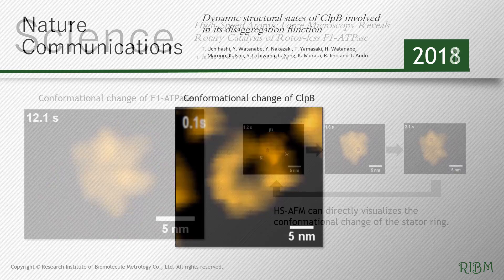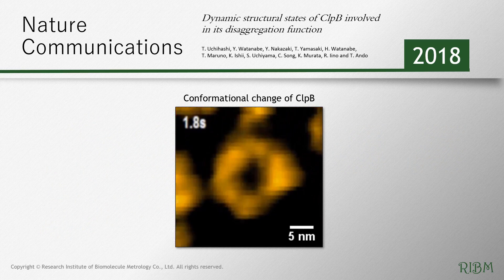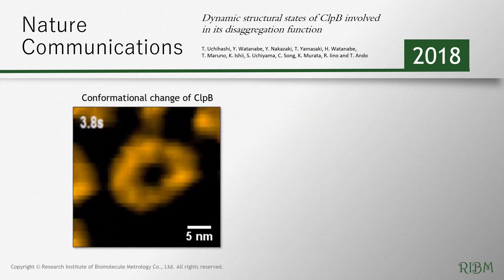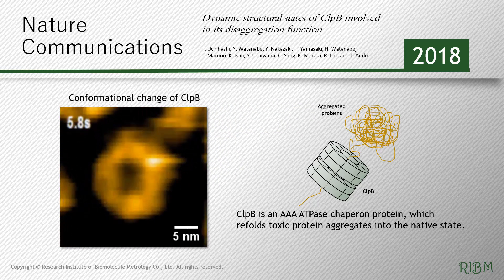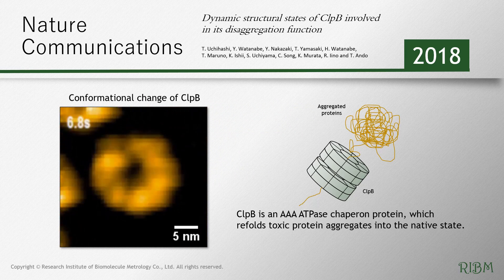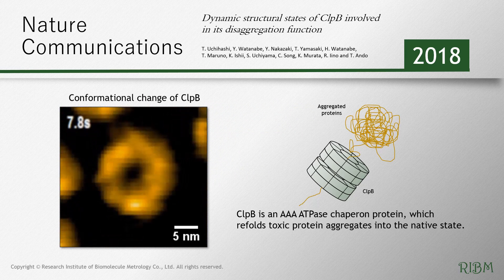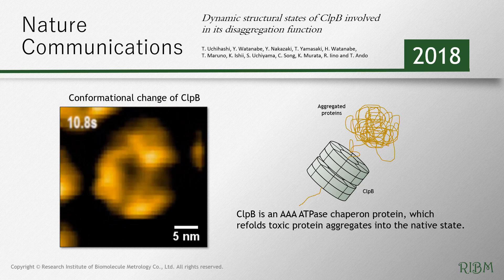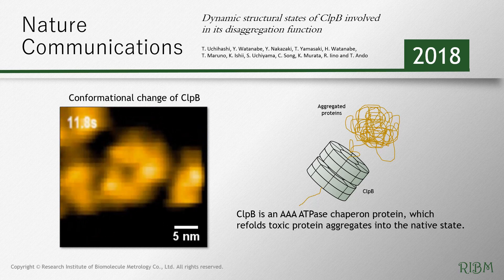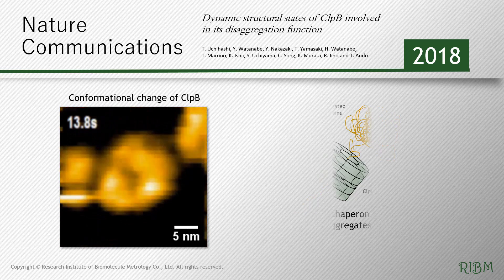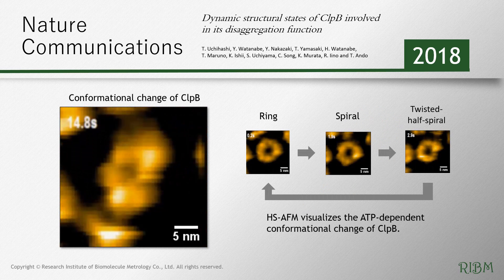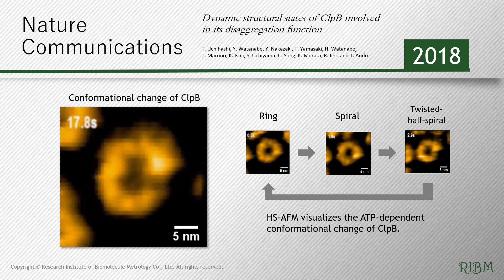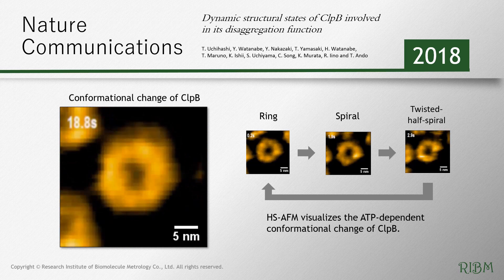The video shows the conformational change of CLPB. CLPB is an AAA ATPase chaperone protein which refolds toxic protein aggregates into the native state. High-speed AFM visualizes the ATP-dependent conformational change of CLPB.